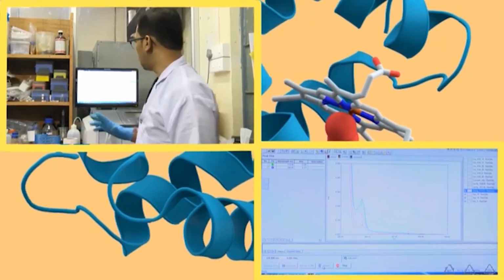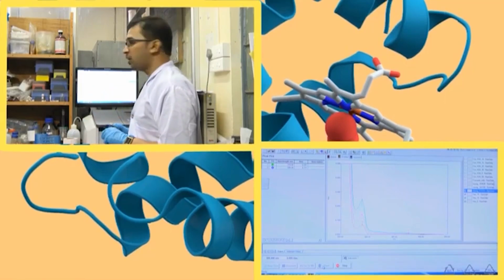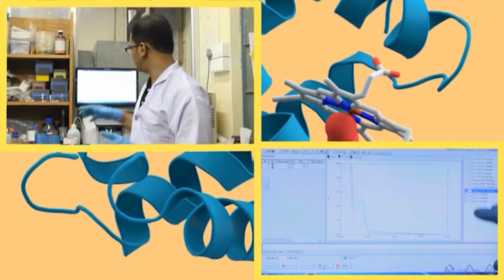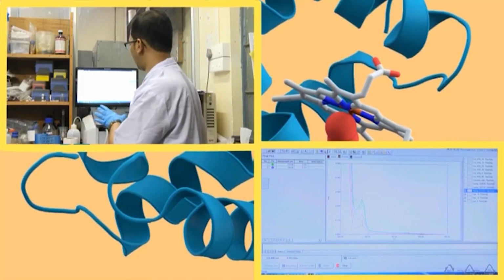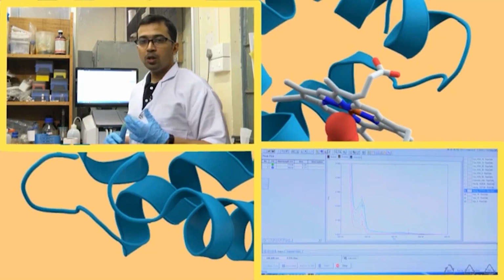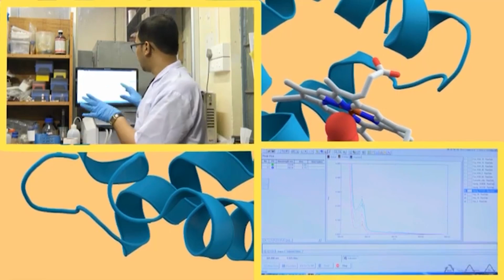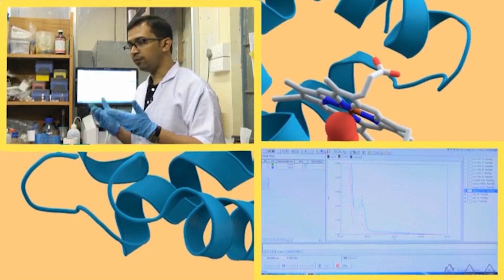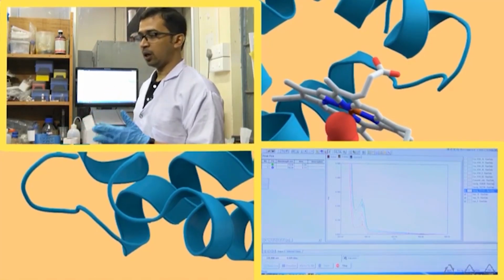So, on a general note, let us just revise the UV curve of this protein, because you might be having your exams now. The UV spectrum of this protein contains one lambda max, around 278 or 280 nanometer. For different amino acids, as we have previously seen, the UV absorption spectra are different, but we are bothered with the UV absorption spectra of aromatic amino acids only, like phenylalanine, tyrosine, tryptophan.